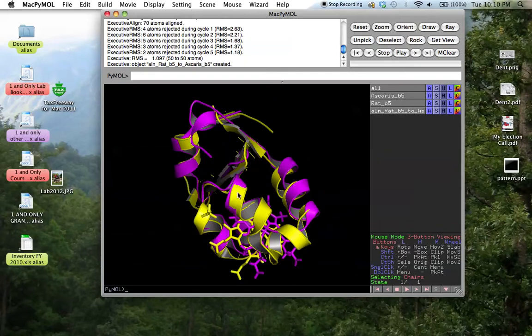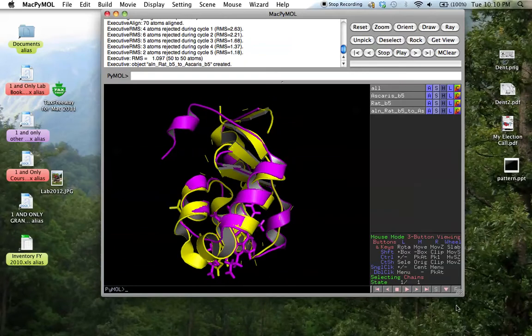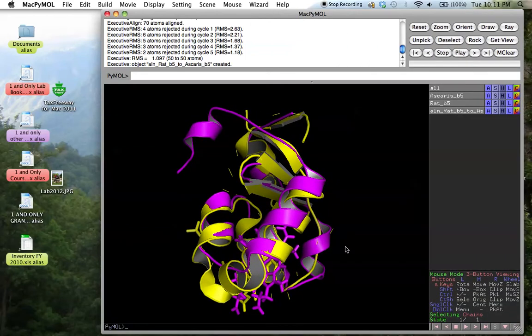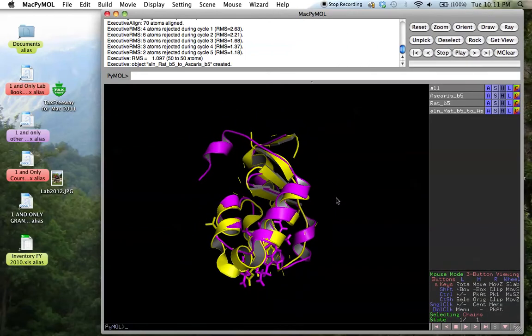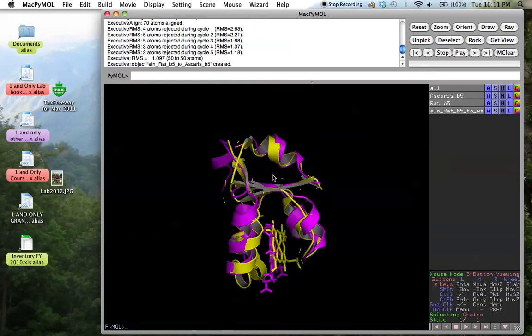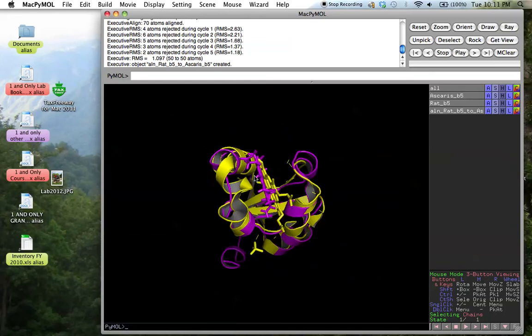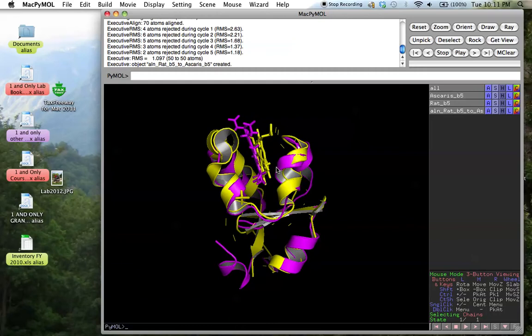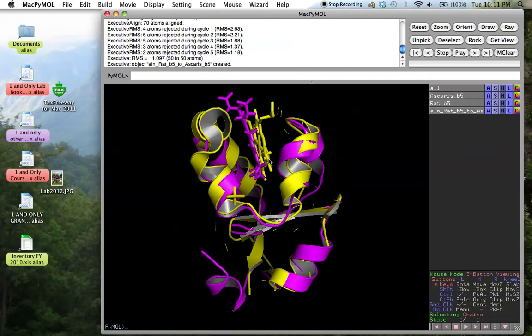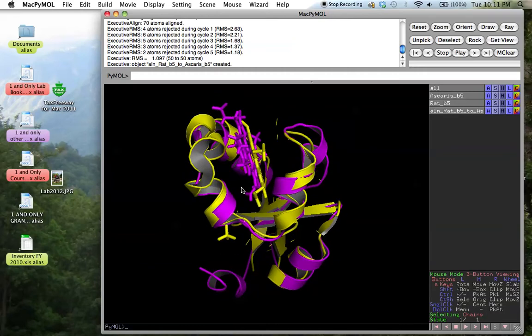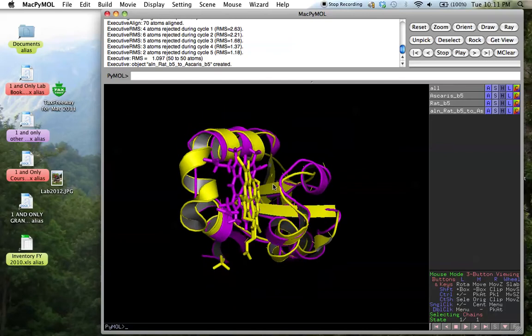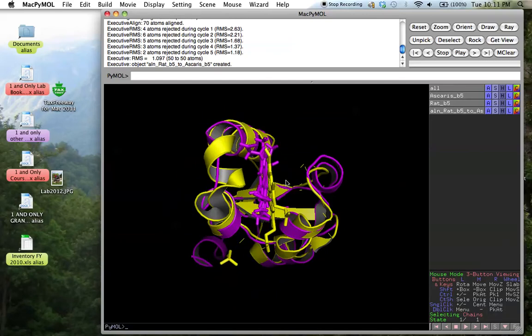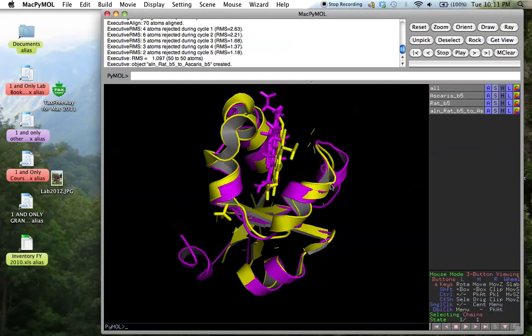Now we've got the two structures aligned. Now keep in mind that their sequence identity was actually quite low. It was actually below the threshold where people normally feel confident to say that two proteins are related or not, which is usually about 25% to 30%, and the sequence identity of these proteins was only about 17%. But you can see here, from the way that their secondary structure elements and the way that the proteins fold, the topology, and even the way that they bind heme, is actually very similar.